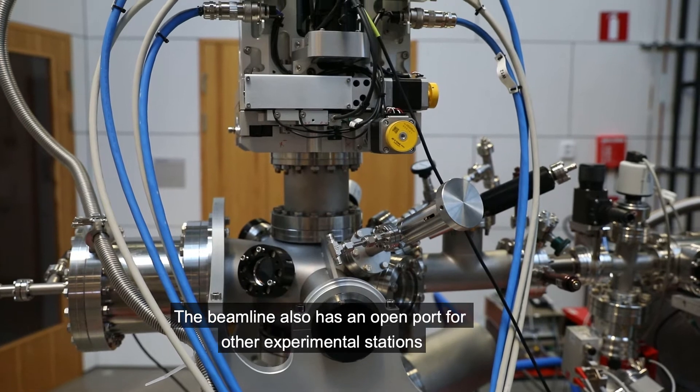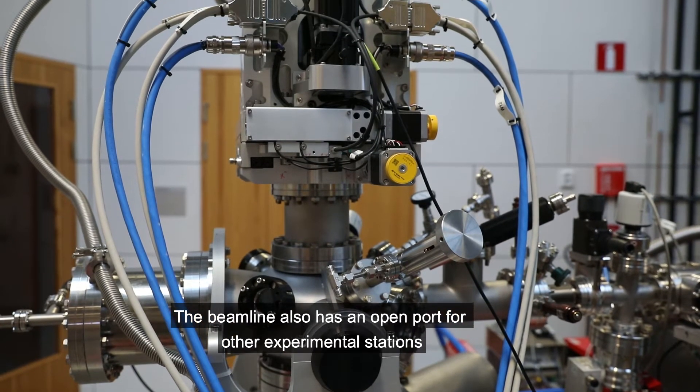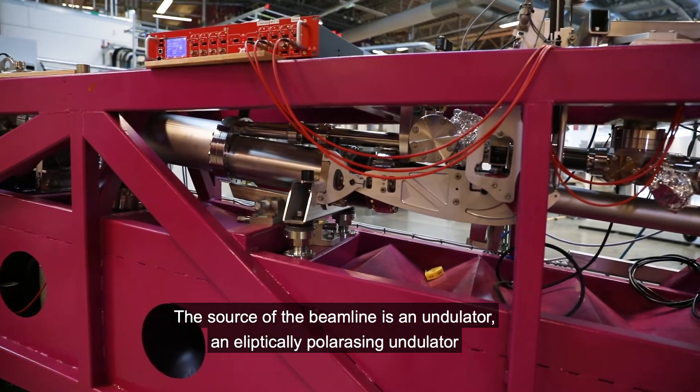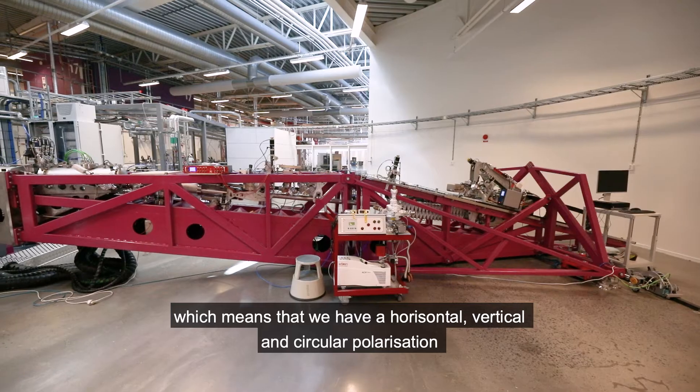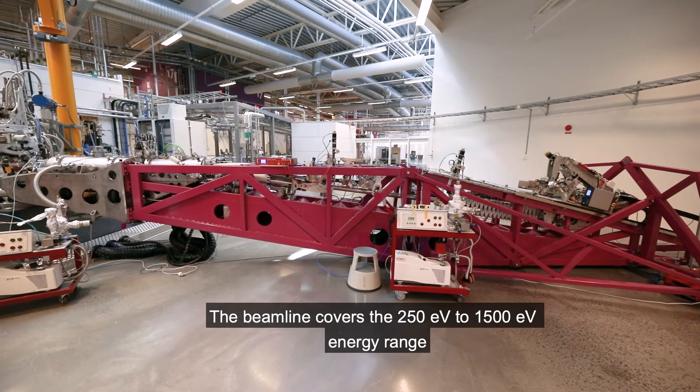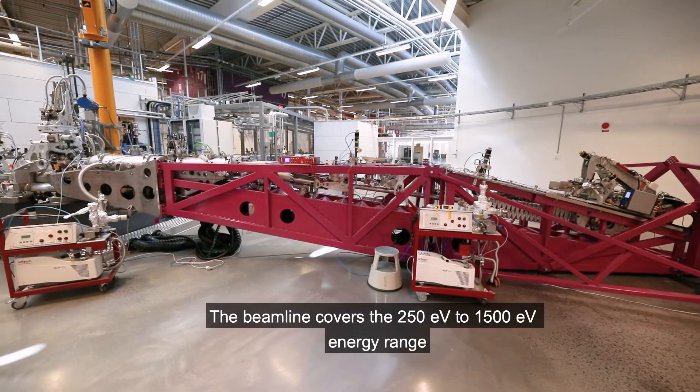The beamline also has an open port for other experimental stations. The source of the beamline is an undulator — an elliptically polarizing undulator — which means that we have horizontal, vertical, and circular polarization. The beamline covers the 275 eV to 1500 eV energy range.